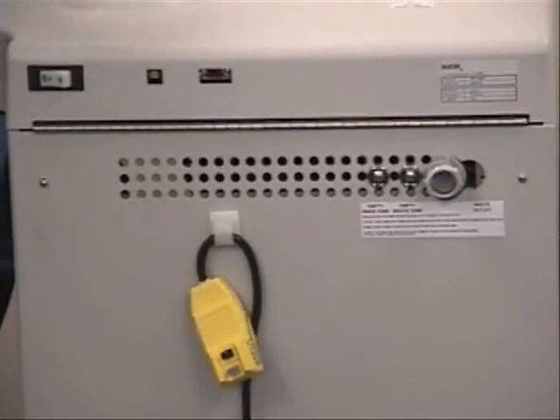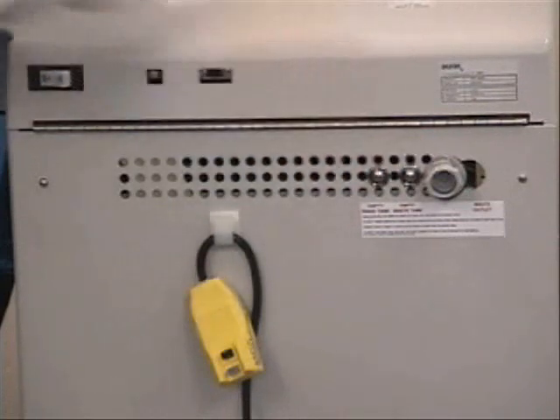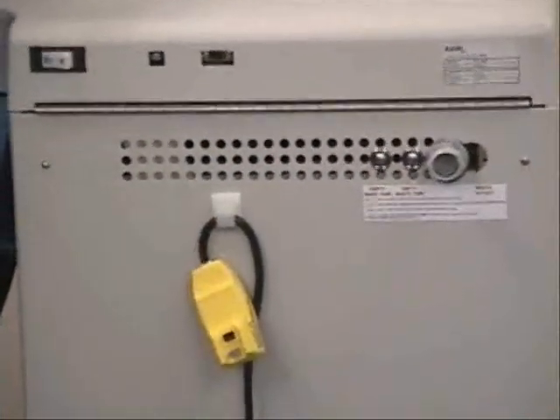Here at the rear of the unit, we have the main power switch. This quick connect port is used when draining the waste tank. These two buttons are used to initiate the draining of the rinse tank and the waste tank. And the system comes equipped with a retractable 30 foot power cord.